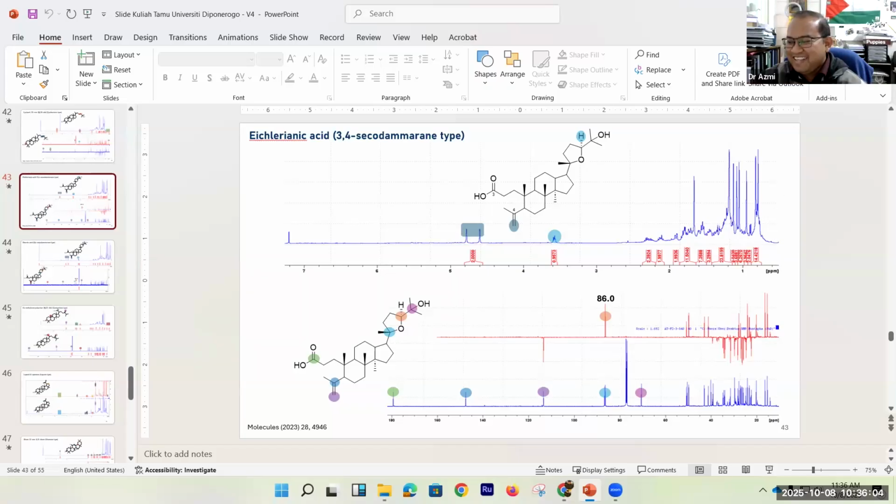Thank you for the visiting lecture that you have given to us. It gives a new insight about using 13 carbon NMR, well, I can say that it's kind of a prediction, right? The prediction using a database. You already mentioned the drawback of these methods, because of limitations.